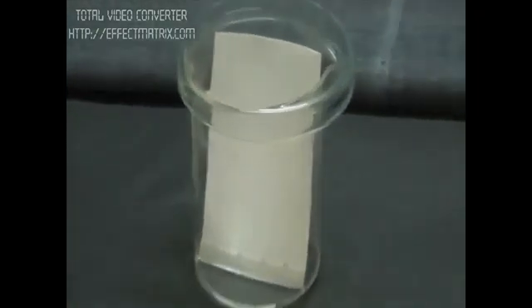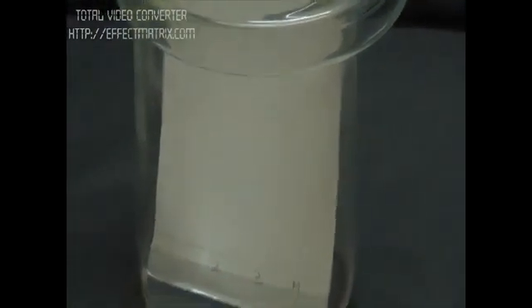And acetic acid also functions to provide humidity in the chamber. Now we are ready. The mobile phase is running through the plate. We'll remove the plate when the mobile phase has moved till the other end.